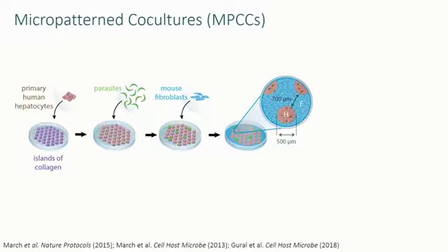This in vitro system is based on a co-culture of primary human hepatocytes that are seeded on islands and surrounded by supportive stromal cells. In that way, we stabilize the functional hepatic phenotypes for up to 3 to 4 weeks. Our primary readout is imaging.